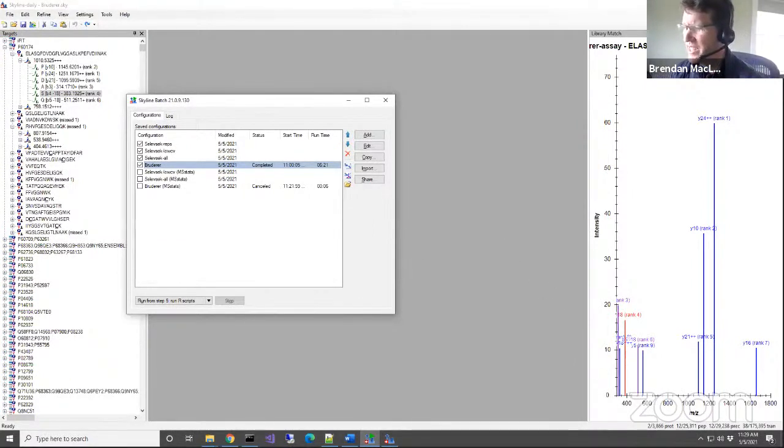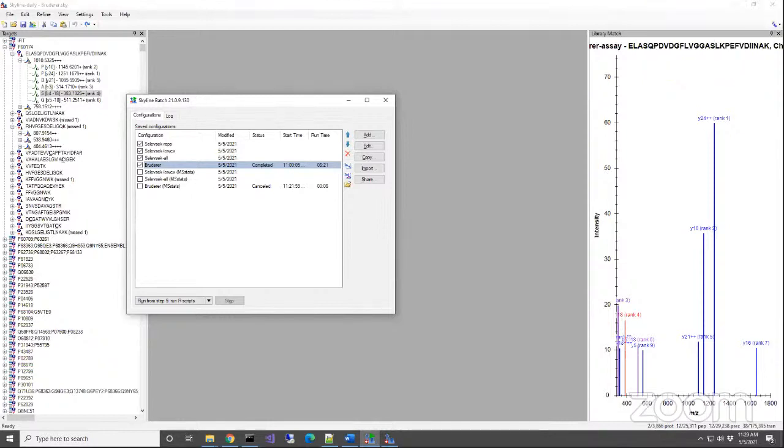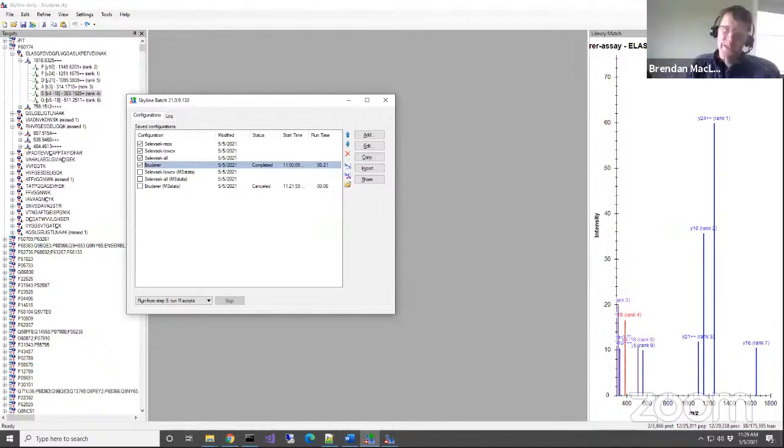Lots of possibility. But okay, so if that's what you're suggesting, oh, you can change the order. If the configuration is checked and you decide that you want to run the last configuration next, you just put it at the top of the list. Oh, well, there you go. So it is essentially already a queue, and we do allow you to change orders of things.